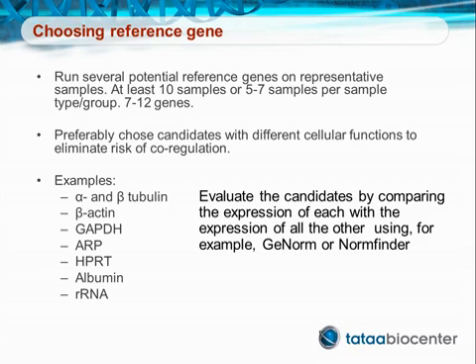Due to the way most algorithms select reference genes, it is also important to select genes that are not co-regulated when choosing candidate reference genes. Otherwise, co-regulated genes may accidentally show up as a preferred reference gene pair, even though they may be regulated in the sample studied.